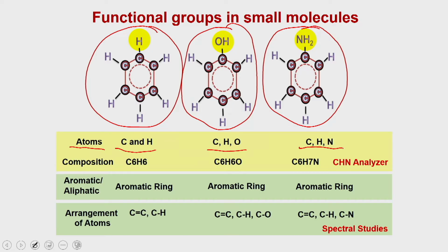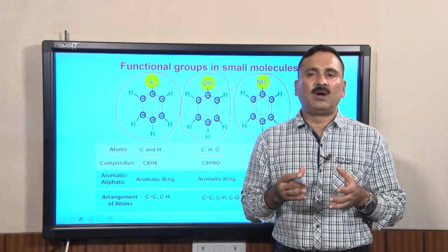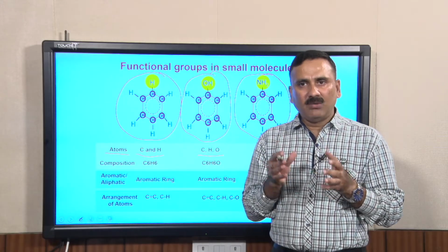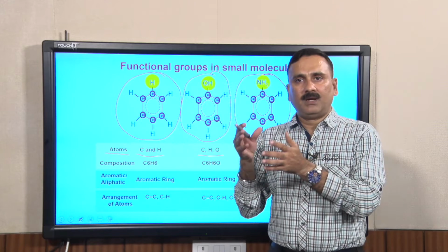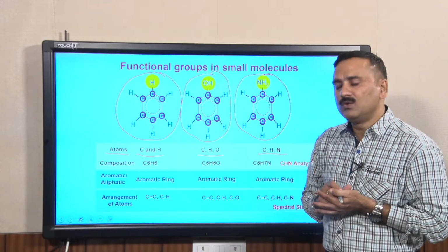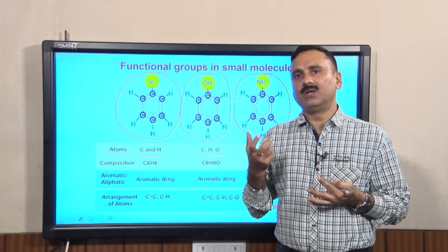The first thing you have to do when you synthesize a new product, or purify a new product from the overexpressed cells which is non-biological in nature, meaning small molecules such as reaction metabolites or secondary metabolites, is to do the composition analysis of the constituent atoms present in that particular product.